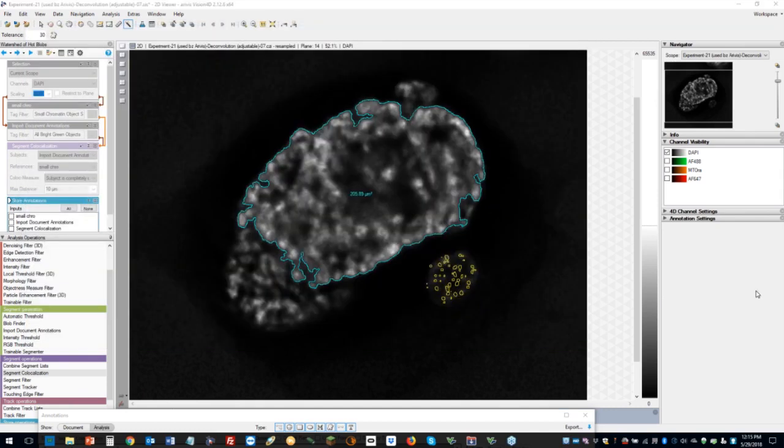Question here from Lindsay, and she asks, you talked about the capability to handle and visualize and analyze large data. What's the limit or the biggest image size you've had? That's a great question. There is some kind of upper theoretical limit, and it was computed. It was told to me it's some weird name. It's not petabyte, it's like femto mega gigabyte.